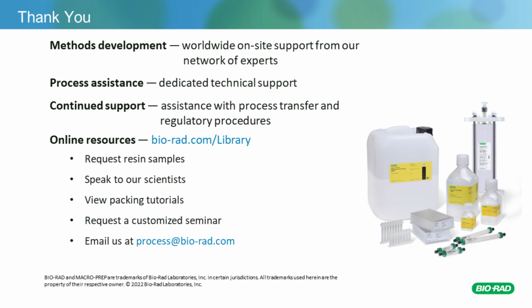Our first question is, has affinity chromatography been used for proinsulin purification? That's a really good question. Yes, affinity chromatography has been used in the past, but affinity chromatography can be expensive, and so we thought that the process scale-up could be more economical with CIEX. And we were also able to get a higher recovery and purity compared to reported processes using affinity chromatography.